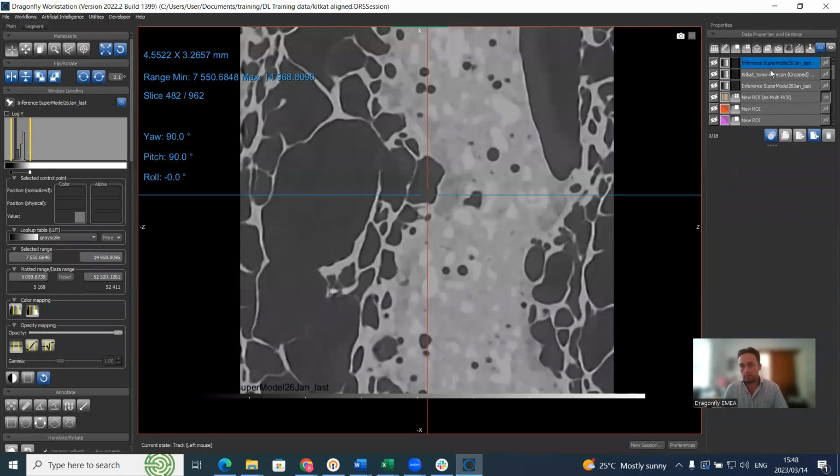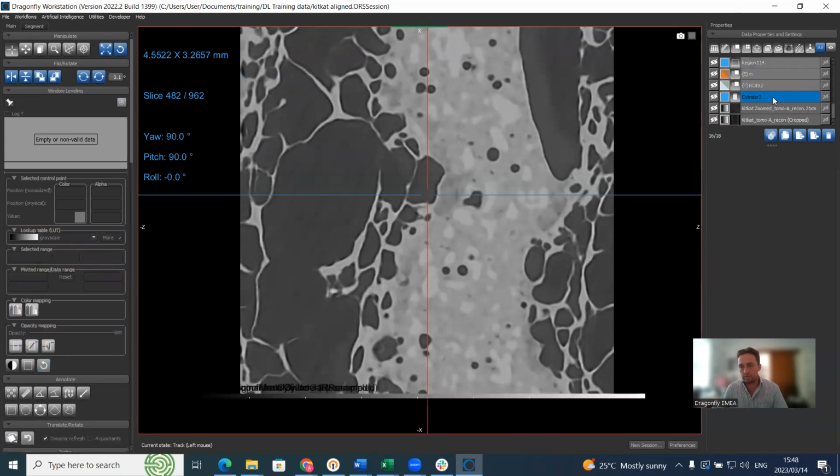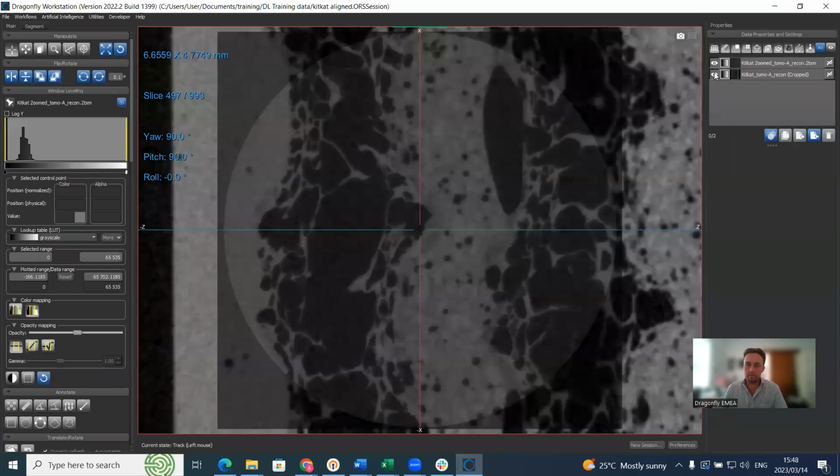And actually, I will delete a lot of these objects here. I will highlight everything at the top and delete those. So we don't need all of that right now. I just left it there so that you can have a look at it if you need.